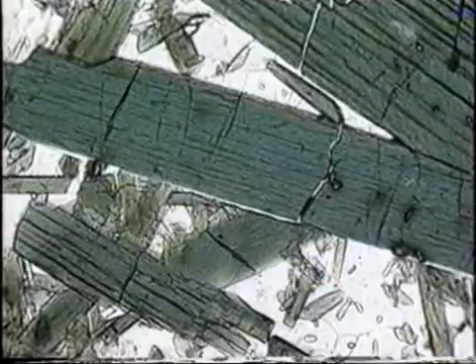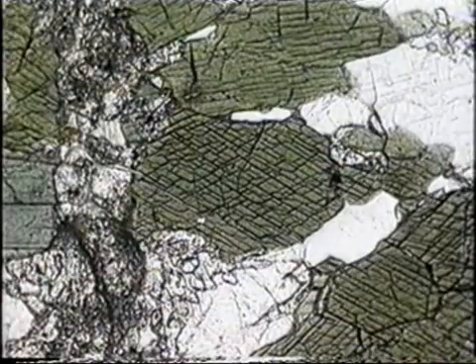Hornblende shows the typical monoclinic amphibole features like tremolite and actinolite, but has stronger colour and pleochroism. The maximum extinction angle is about 25 degrees. The development of cleavage in prismatic sections varies widely from sharp to diffuse to absent, depending on grain orientation. But transverse sections like this show it well.